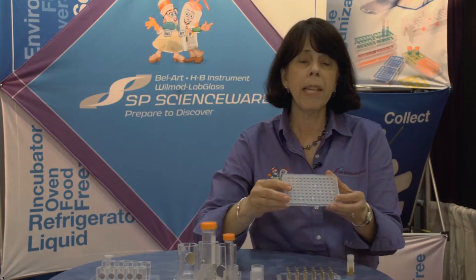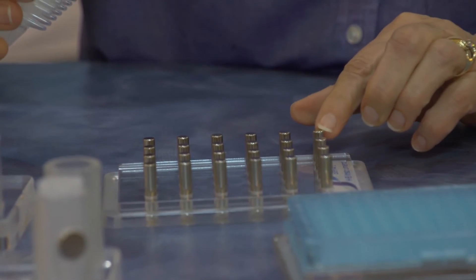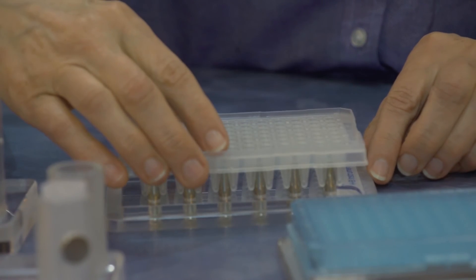Moving over to the microplate racks, our PCR rack has 24 vertical magnets on the top face of the rack. I simply put my conical bottom PCR plate on top of the magnets. It's held firmly in place and the magnets will collect the beads in each tube on the wall of the tube.